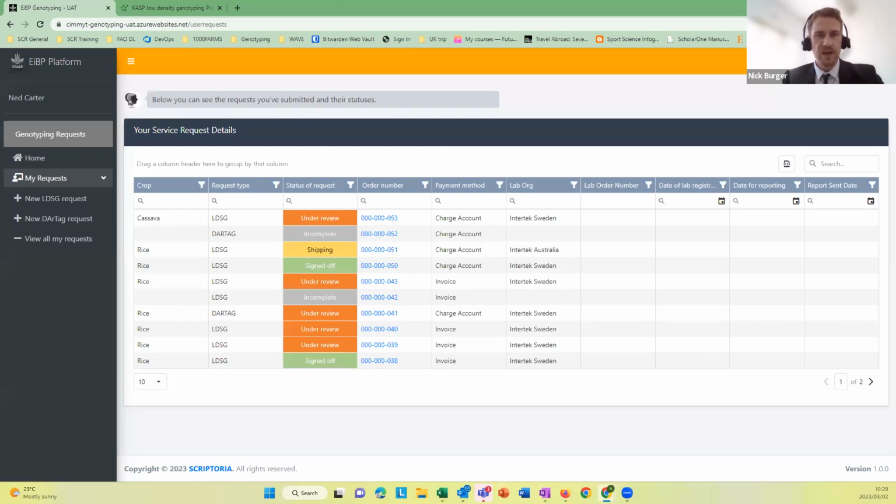The admin or the decision maker will receive a notification that the service request has been submitted again. I, as the decision maker, will return to my platform to once again review this request, and then I will respond, all is in order, and I will sign off now because that code is now correct. So let's sign off. Let's refresh this page, and now I will see this request has been changed to sign off, and I, as a service user, will receive a notification that this has been signed off.